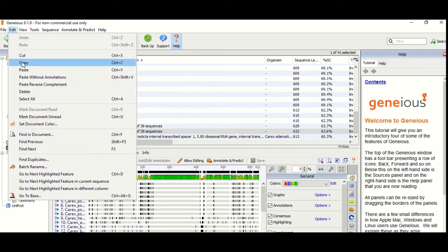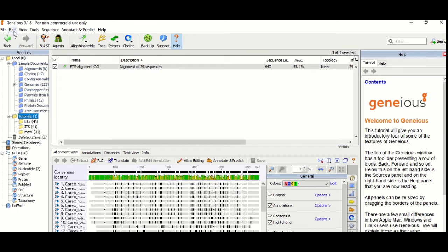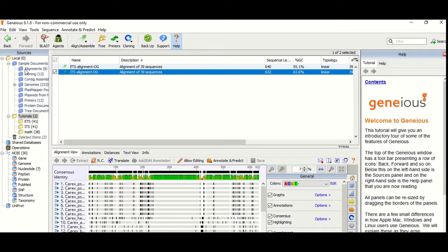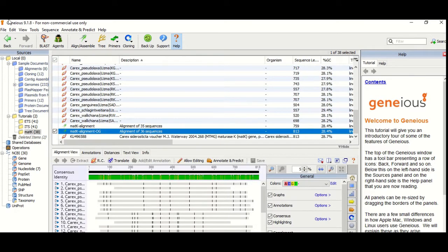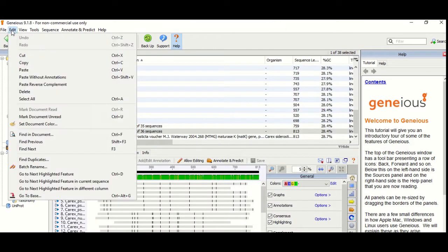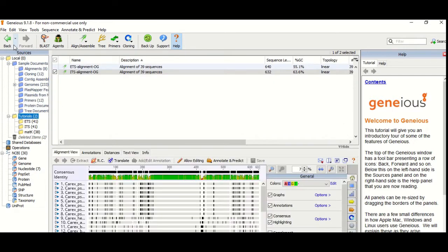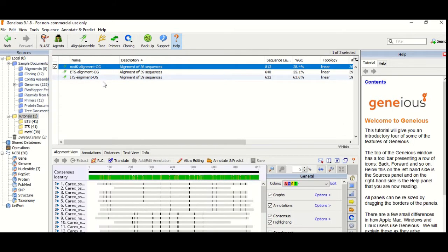As I have told you in my previous video, you have to trim the ends — from the start and the end — to make the alignment equal in length. Save the modifications to the trimmed alignment.